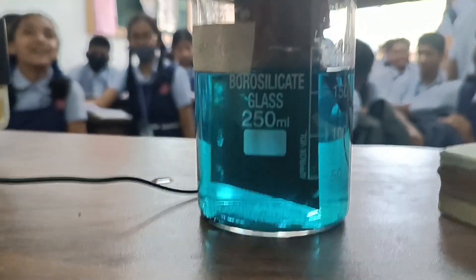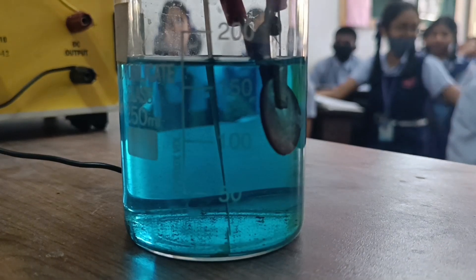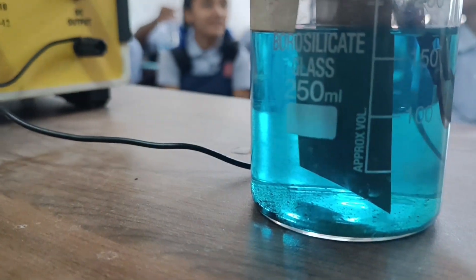The copper from the copper plate dissolves into the copper sulphate solution. In this way, the loss of copper ions from the copper sulphate solution is made up and the process continues.